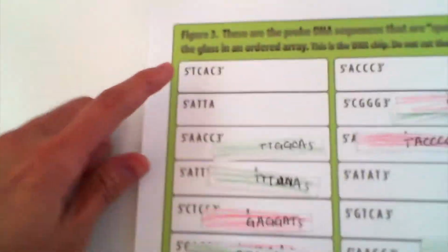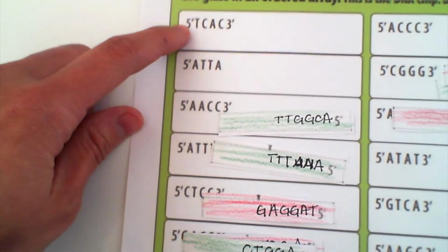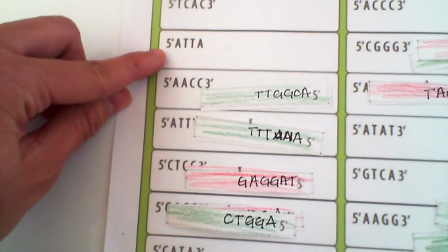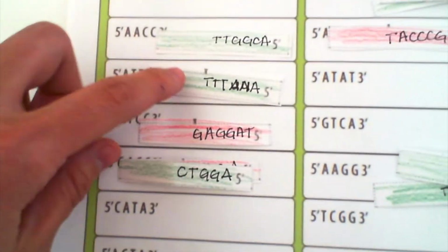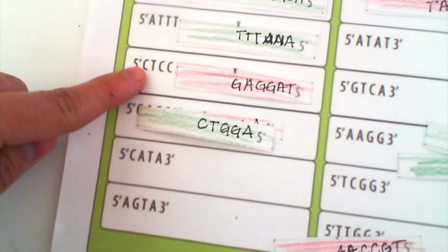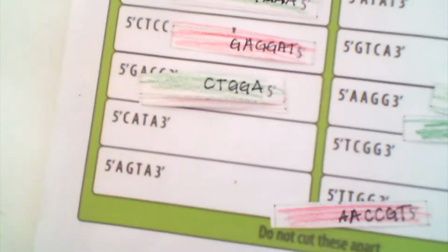So for this gene, what color do you think the microarray would fluoresce? This one has both, so what color will that one turn out to be?